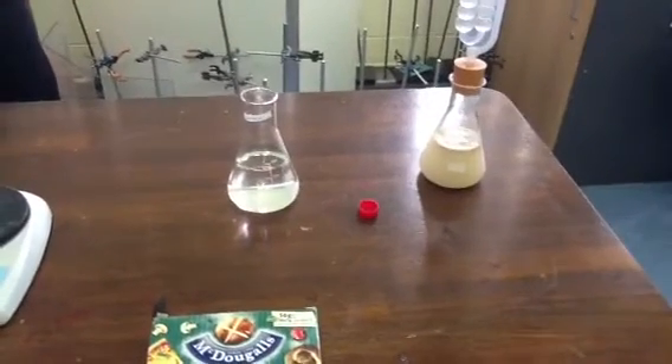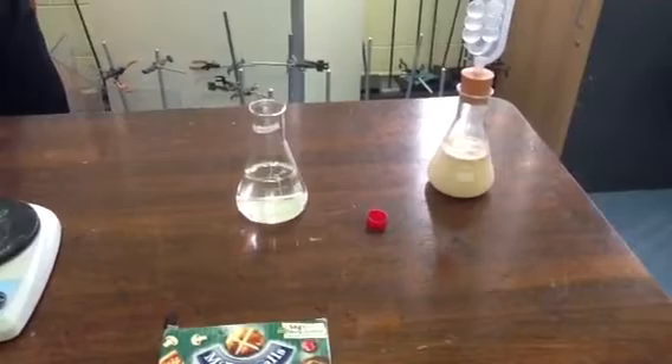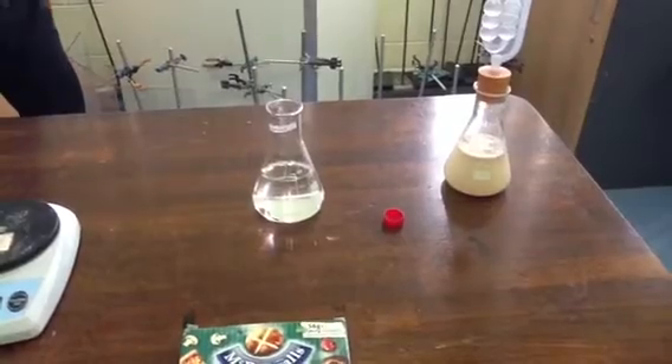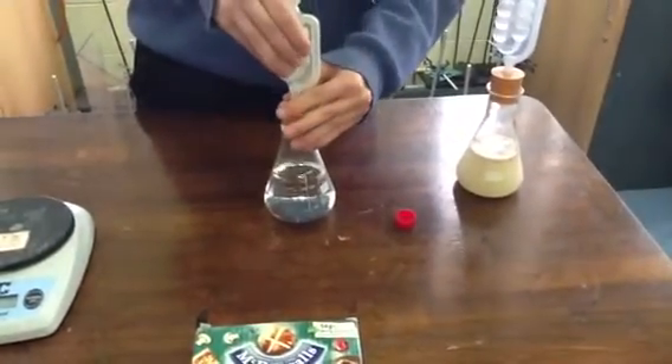Once we have these set up, we're going to put them into an incubator. Cailin, what temperature are we going to have the incubator at? 30 degrees. We're going to put the two conical flasks into our incubator here.